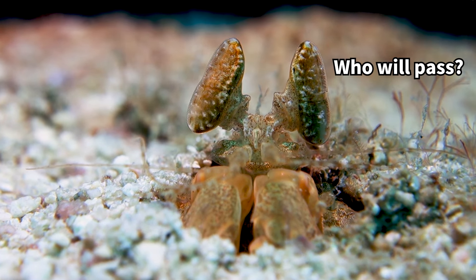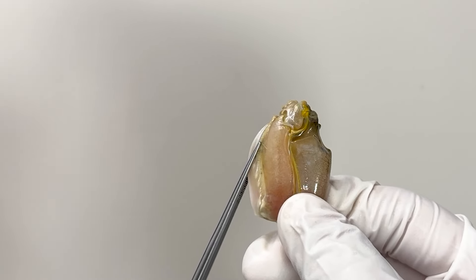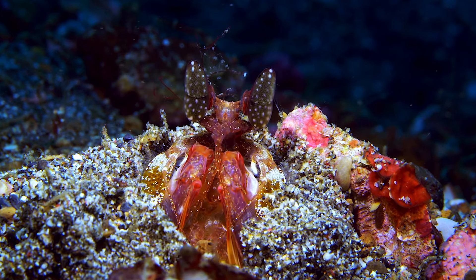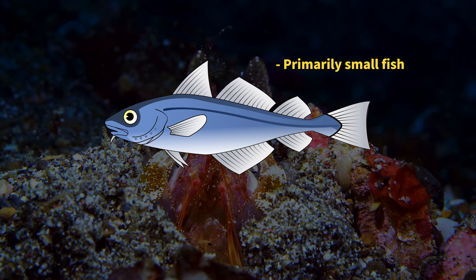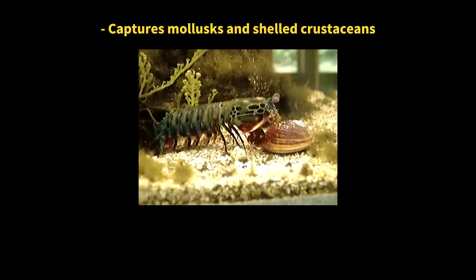Mantis shrimp dig burrows in the seabed, hiding and ambushing passing prey with their raptorial legs. Their hunting style varies with the type of raptorial legs they have. For instance, the spear-shaped legs of the Japanese mantis shrimp primarily target soft prey, while the ball or club-shaped legs are used to break open hard-shelled prey like shellfish.